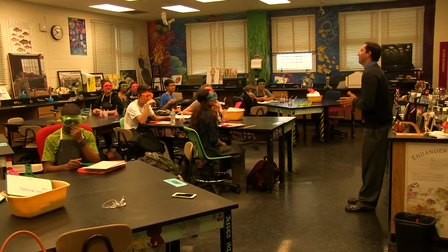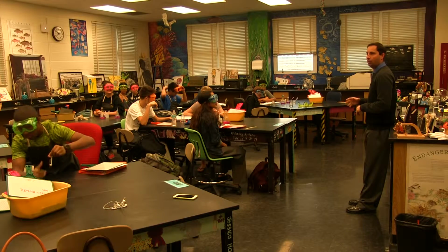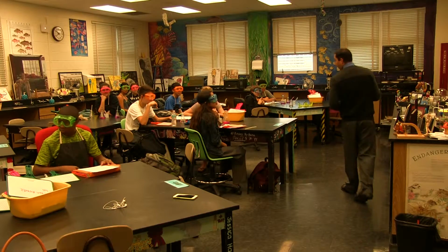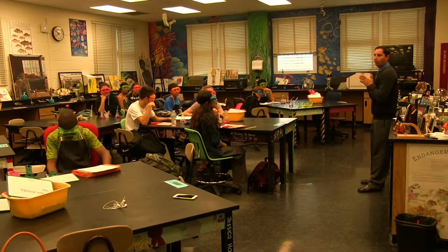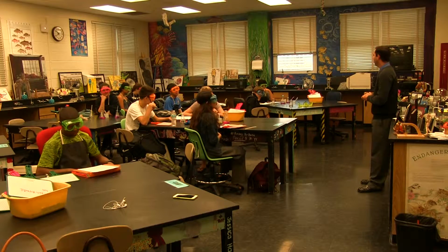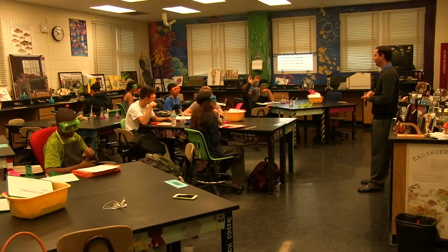Today we're going to do our cell respiration lab. It's a lab for us to check out how well you guys can quantify your respiration rate. So we studied cell respiration for a while. Today we're actually going to be able to see it. So before we get started, I want to make sure that you guys know what we are going to take a look at. So I need one reactant for cellular respiration, just a single reactant, one of them, just one.